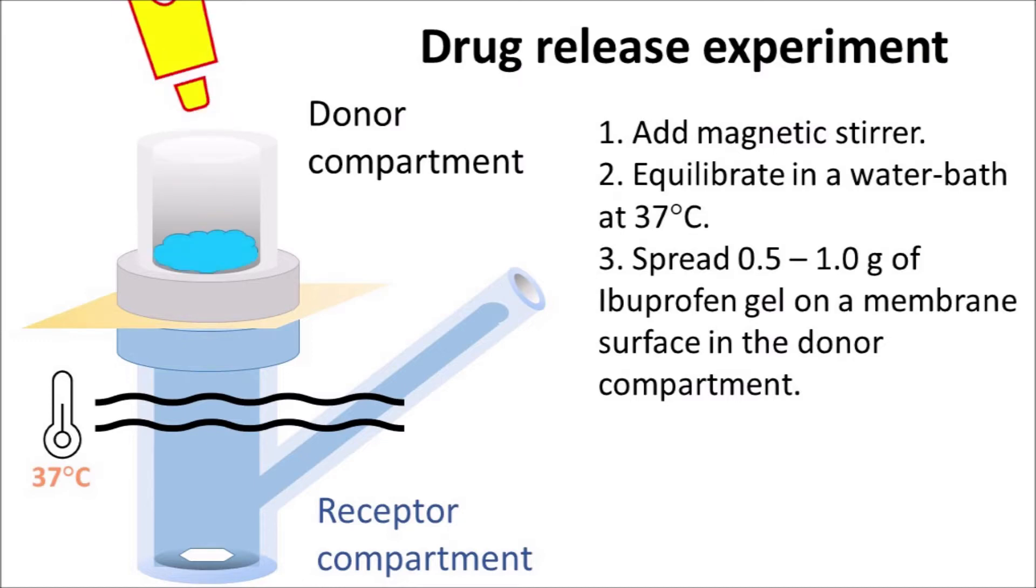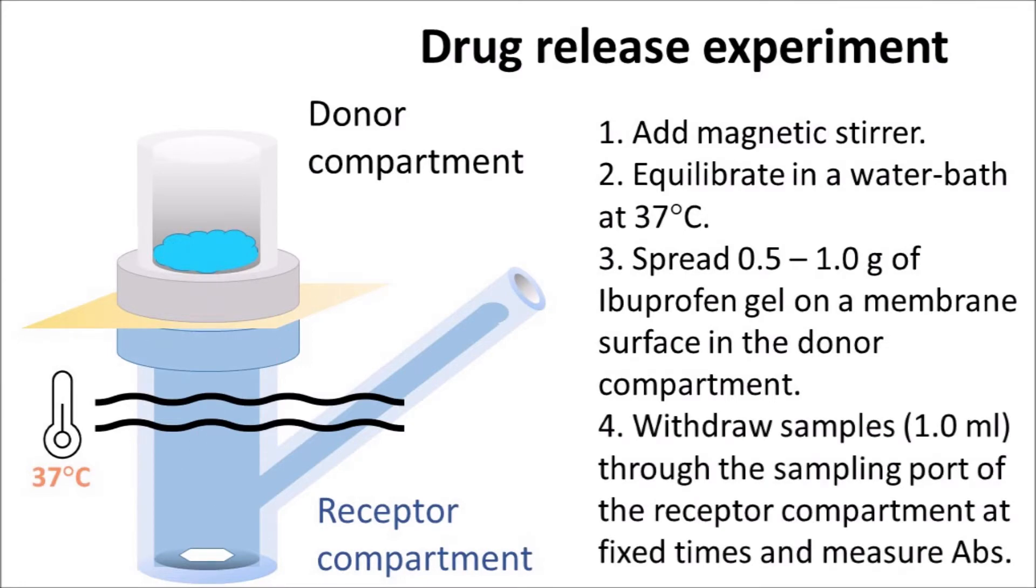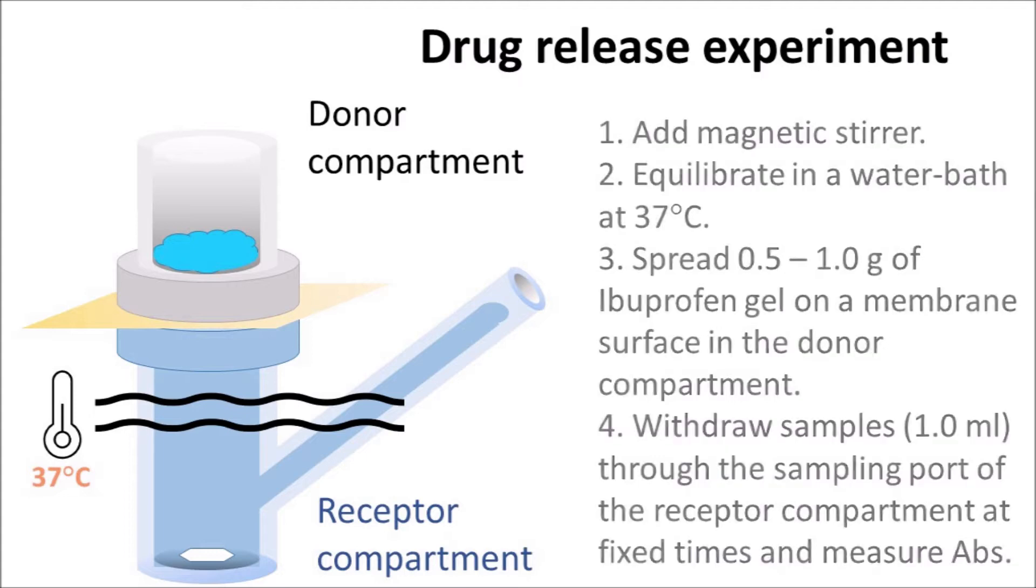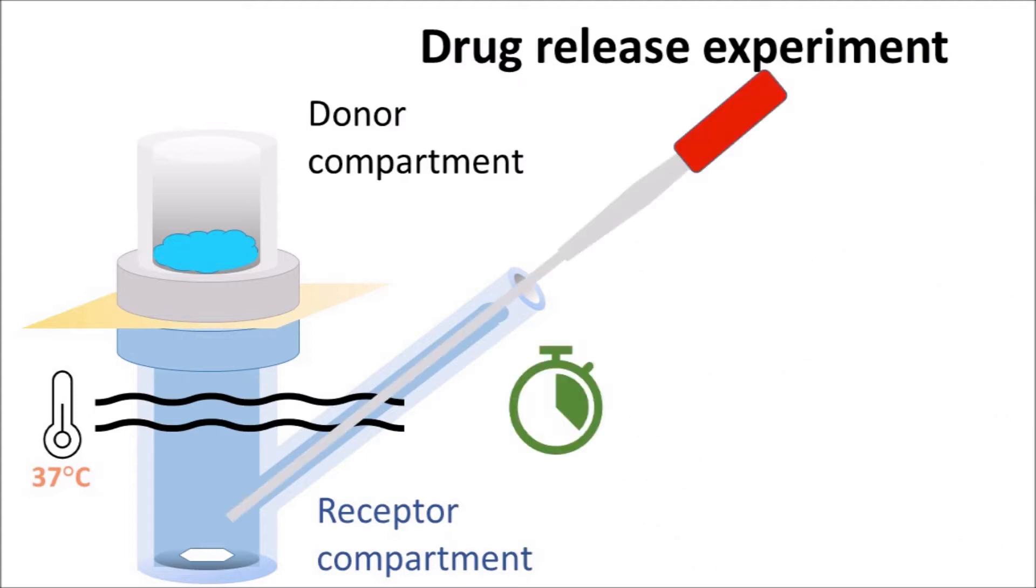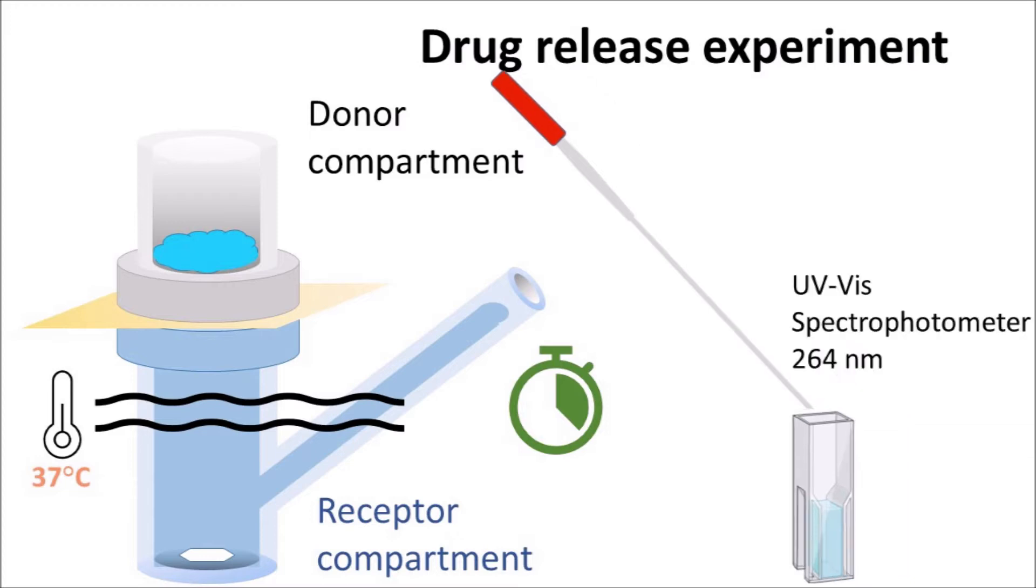We will spread around 0.5 to 1 gram of ibuprofen gel on the membrane surface in the donor compartment. Ibuprofen will start releasing from the gel, permeating through the membrane, and we will be sampling the drug from the sampling port. Then we will use UV spectrophotometer to assay ibuprofen.